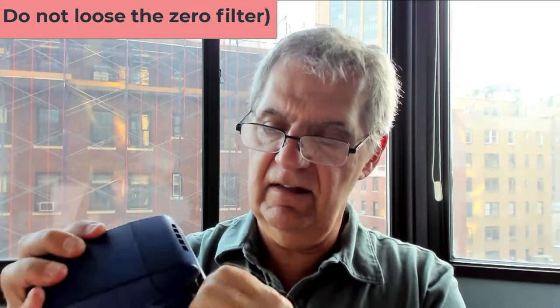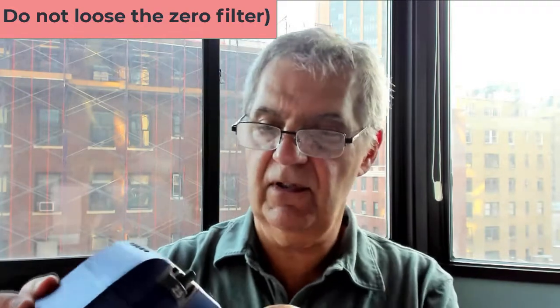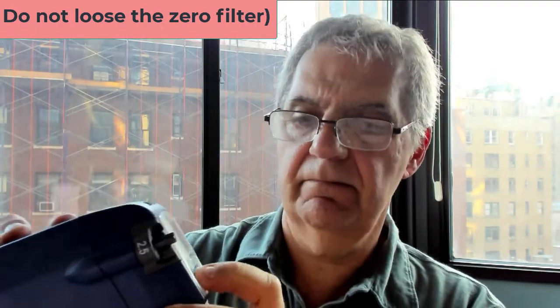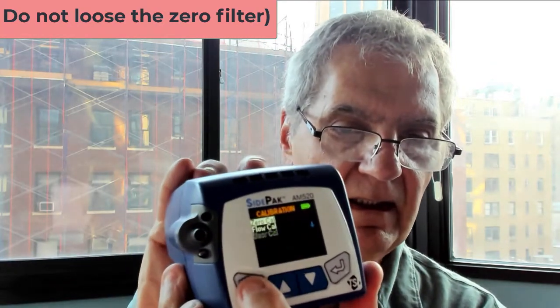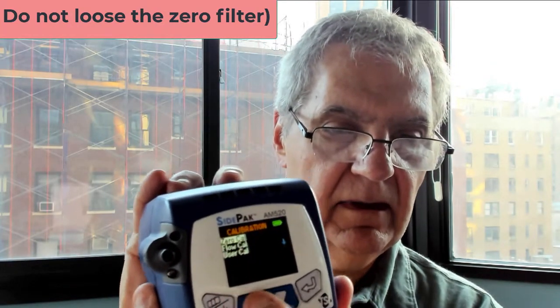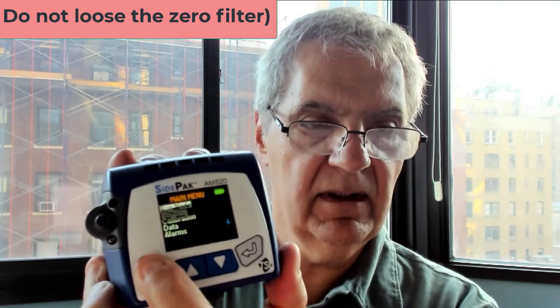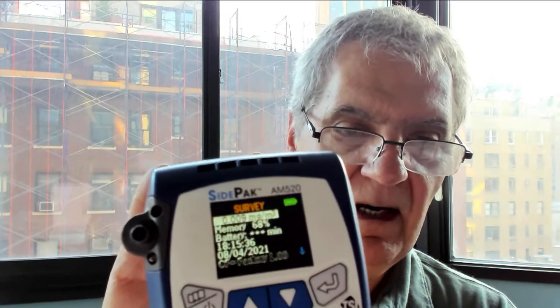It says zero calibration complete. I take the zero filter off, put it away, and hit go back — and there we go, we're back to run mode. There may not be much of a difference because we calibrate this all the time. We always set it to zero before you start your day.